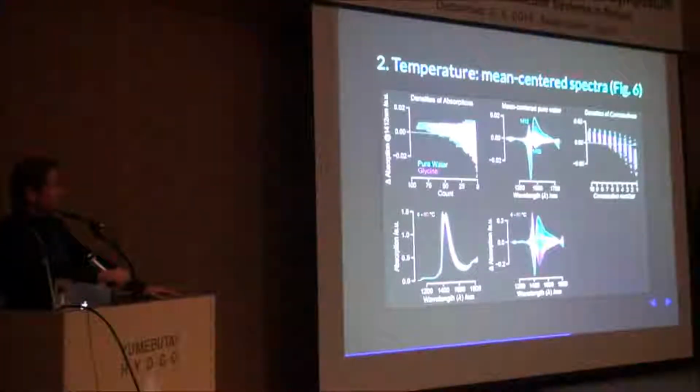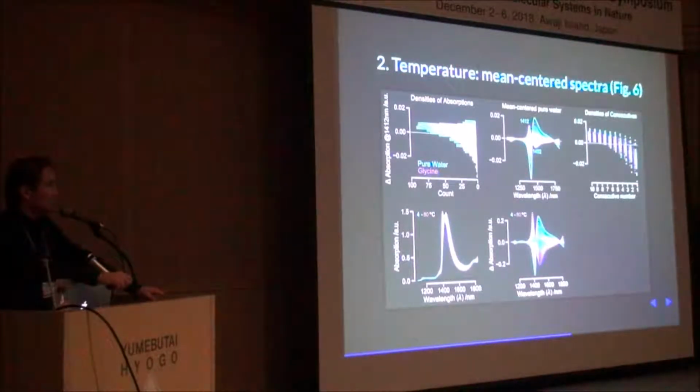So if I filter this, putting here all the first consecutives and all the way to the 10th, we can see what happened. We get this curve. Pure water is shown in cyan, and glycine follows that, just like here. Everything related to glycine is shown in magenta, and so basically glycine is following water pretty much. So we have here that most of the later consecutives are focused around positive values, and that these negative values mostly originate from the earlier positions.